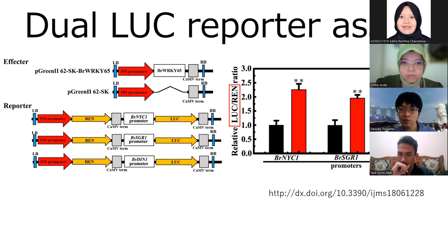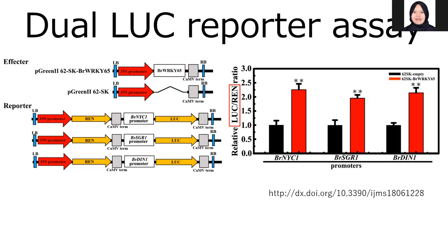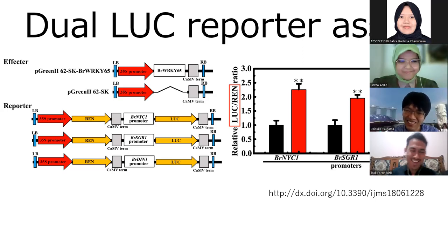And more importantly, probably, it can allow more in vivo reporting. This is a reporter assay requiring breaking the cell. But the most important benefit of GFP is that it can be observed in situ, in vivo, without killing the cells. We just have to give the blue light and get the green light. That's the GFP. If we use the fluorescent timer, we may be able to get a more precise response to some stimulant or some promoters upstream of the fluorescent timer. That's my guess. Okay, thank you. I have to survey some examples.